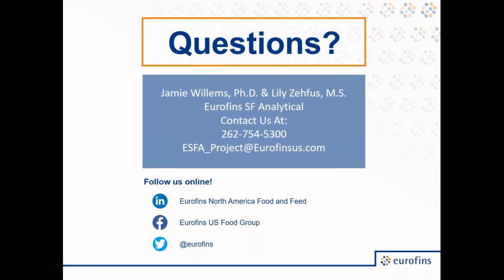All right, thank you. And then our second to last question here is, just curious, a lot of people are concerned about water bottles sitting in your car in the summer. Have you done any tests on this, and what did you conclude? Well, we haven't done that specifically. We have done contaminated water bottles where they've been contaminated by factors like cigarette smoke and environmental conditions. And there we could, in fact, see evidence of the contamination.